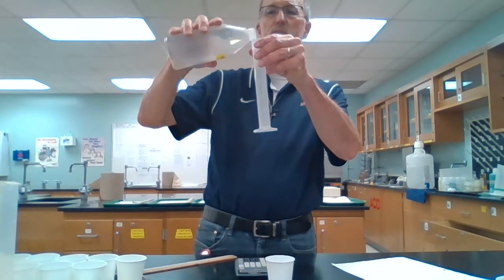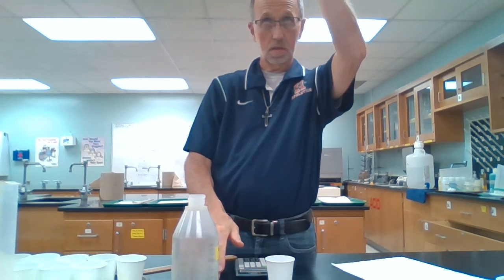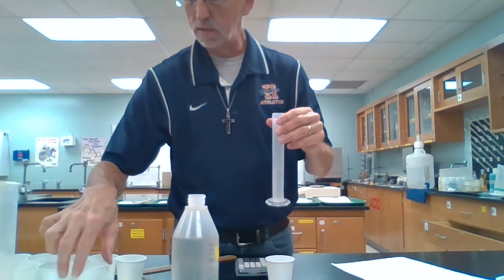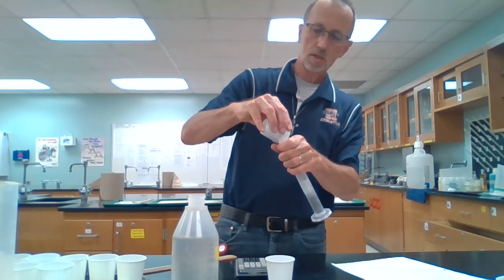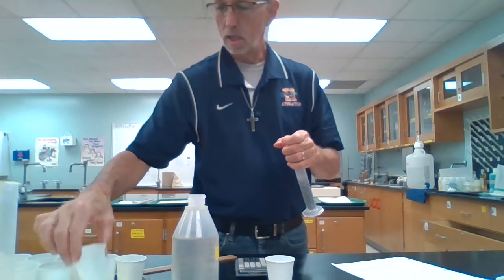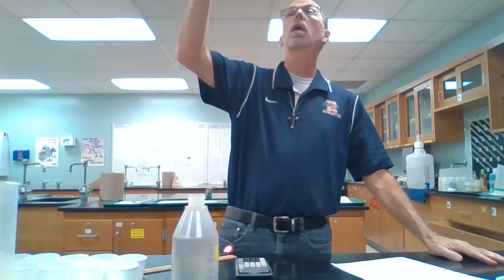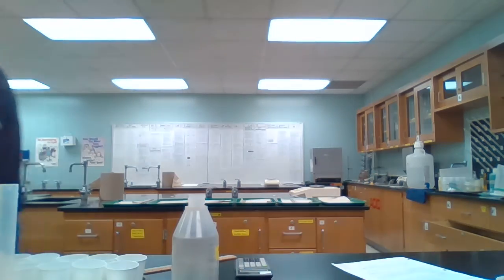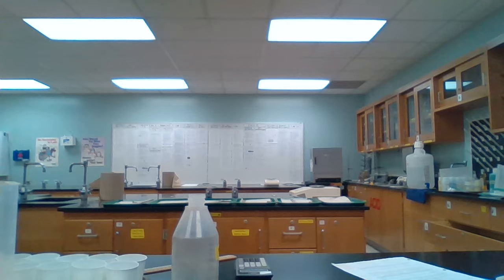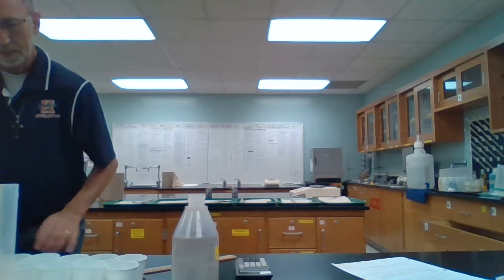Zinc number 2, which is a bunch of little pieces. Get my initial volume there, about 19.0. All right, so put the zinc in there. Try not to spill them. There we go. And it looks like that went up right at 5. So 5.0 mLs for number 2, zinc.